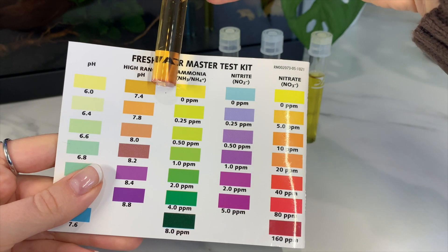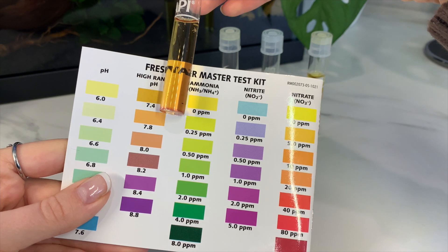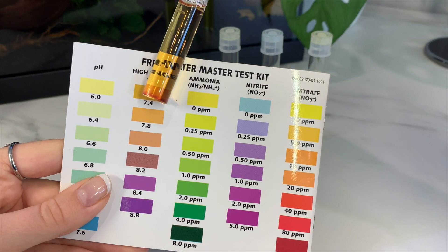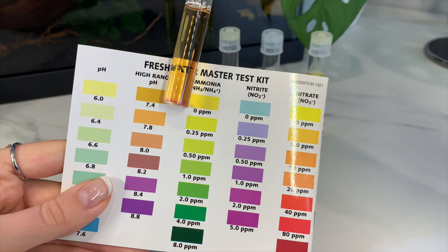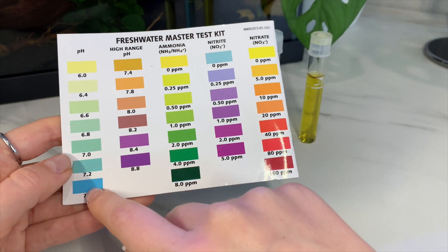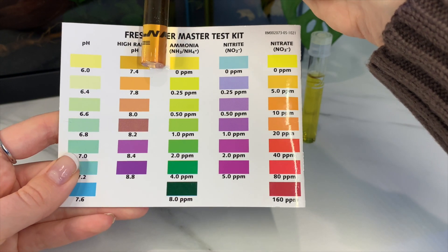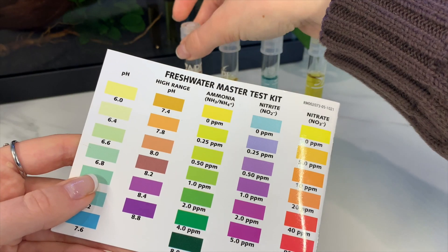It looks like my pH is around 7.4. If I tested it with the lower range pH it's possible I'm at 7.6, but my guess is I'm probably more around 7.4 — so that's good, that's what you want to see in your betta tank.